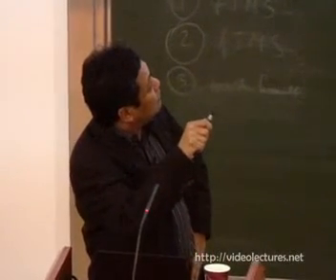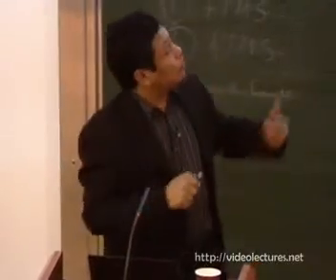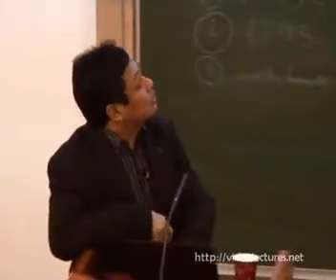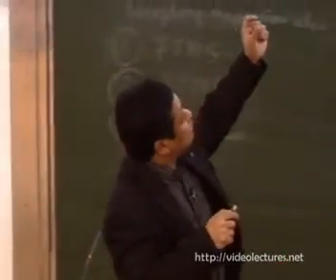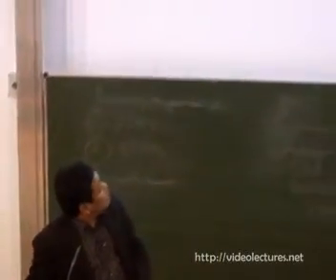When the tip is very close and you move the tip, the atom will follow the tip very easily. So you don't actually need much force to pull out the atoms. We can produce the structures simply by pulling out one atom at a time. So the question here is, what is the distance to approach the tip so that we can take out the atoms cleanly? To find out, we do some statistical analysis.